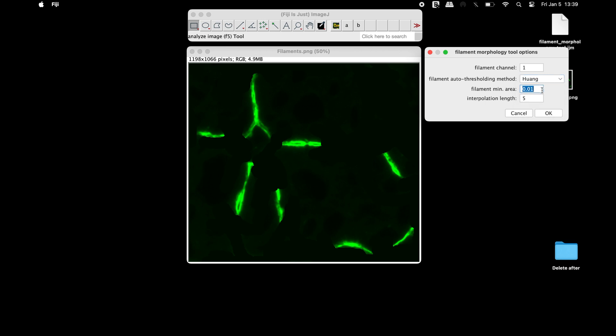Select the minimum area to specify the smallest area an object must have in order to be termed a filament. The interpolation length measures the geodesic diameter. Once all the parameters are set, click OK.